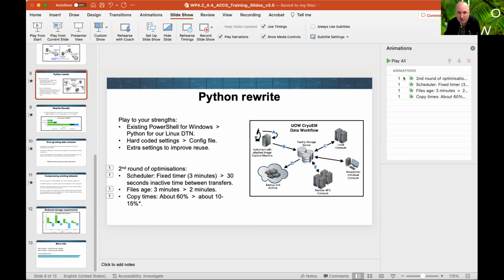Yeah, sorry, I'm more IT than a researcher, so I don't have much of the details. I've dealt with cryoSPARC for quite a while and definitely spoken to people, but I haven't ever actually used it to run analysis. I'm not capturing my own data sets, but yes, I know the initial screening done in cryoSPARC Live was done locally, and then the further processing in cryoSPARC or RELION was done down at Massive.